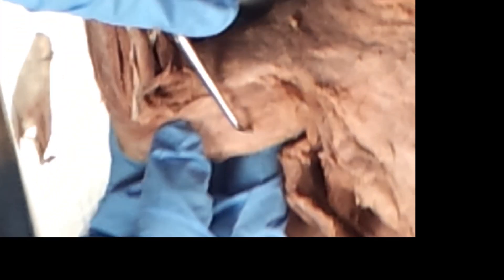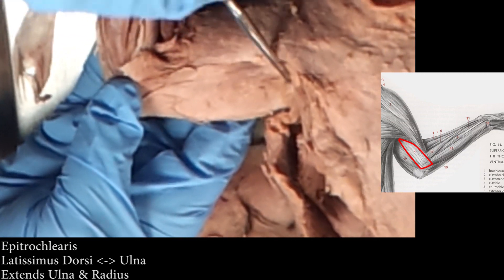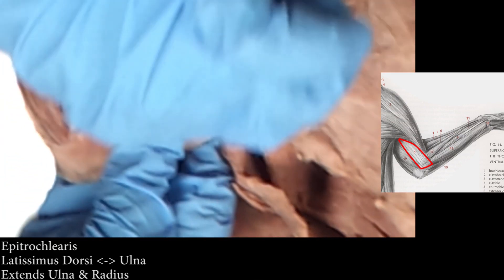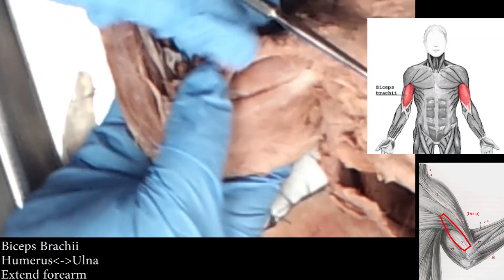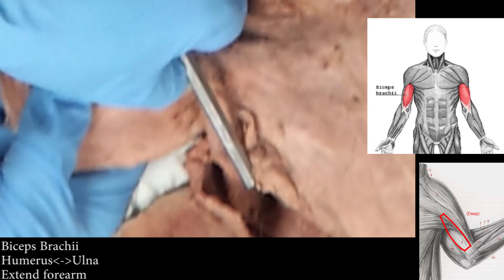So that's your lower arm. Now upper arm is a piece of cake. Right here is the cat-only muscle — this is epitrochlearis. The whole bottom surface would just be our triceps, and underneath this muscle is the tricep. See how thin that is? So the epitrochlearis is a cat-only muscle. What we want to do is get inside here — you're going to see where the pecto-antibrachialis and the pecs run. Pull that open, and what's inside is your bicep. This muscle right here is your bicep, and this is brachialis.